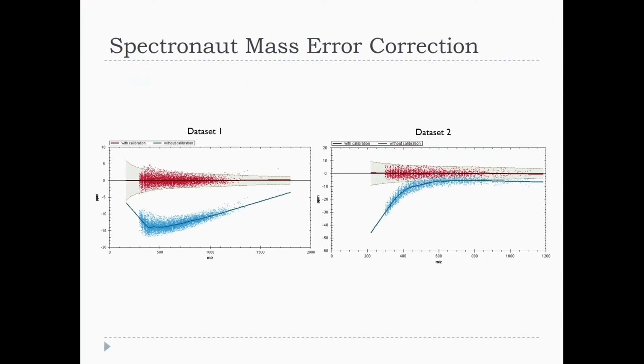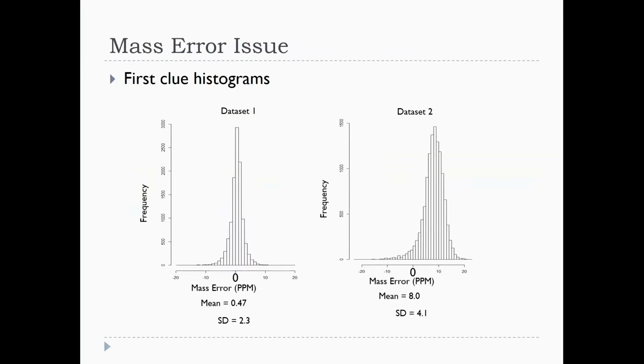And then I actually went and ran Spectronaut, which was doing fine, and I noticed this is data set 1 and data set 2. They have this 2D plot that shows a really nice plot, and yeah, I borrowed from it mercilessly. So this is data set 1. They've got this curvature in data set 1, and wow, crazy curvature in data set 2. And then they have their own internal recalibration. So they just recalibrated, and it didn't impact them that there was this miscalibration.